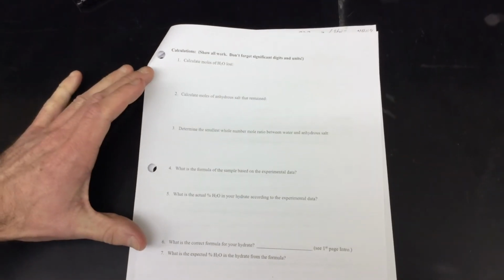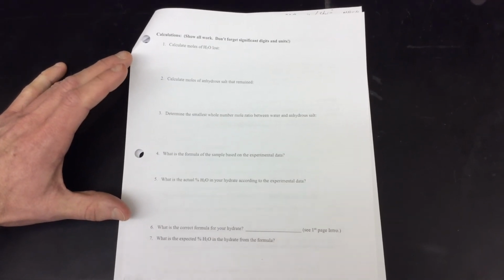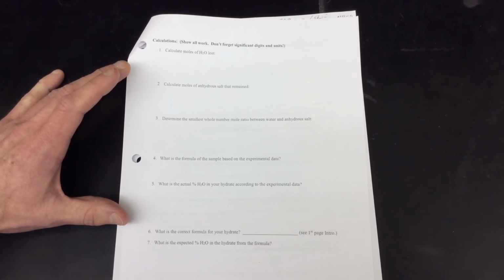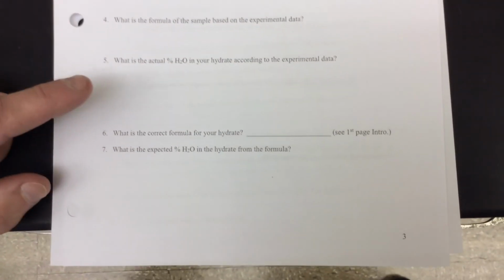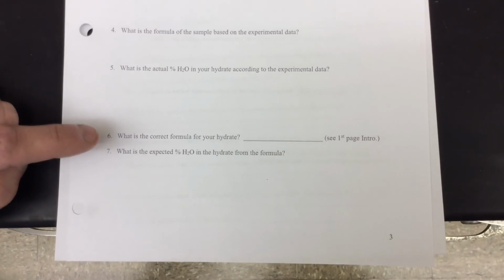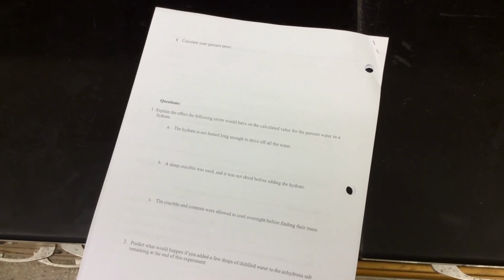The calculations that you want to do are on this page. There is a document on Google Classroom that gives a lot of hints on this page. You definitely want to go there and write down all of those hints. That will make this lab a lot easier. Really what you're trying to get down to eventually is the experimental value of percent water lost and the expected value of percent water lost, and then you're going to calculate percent error. What is the difference between those two numbers? And then there are some questions that go along with that. But that is the general idea. Make sure you go to Google Classroom and get the help from that document.